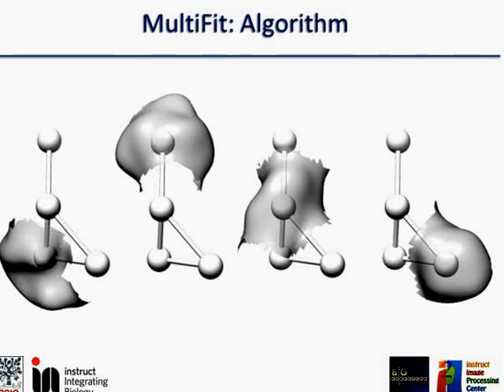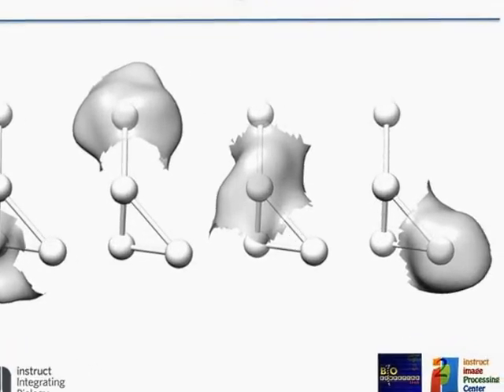So some points here will be neighbors of some points of this region. This is the reason why I draw an edge between these two points. So the edges represent connected regions between my clusters.